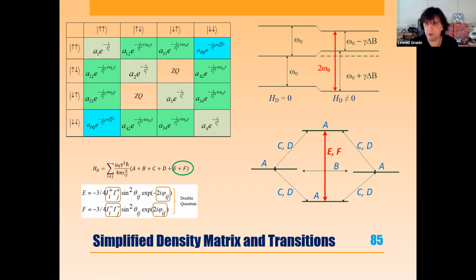But what's more interesting then is the case when two spins come to another condition. It means that, in terms of vectors, they flip simultaneously. This is bringing us the double energy, and this is called double quantum transition.